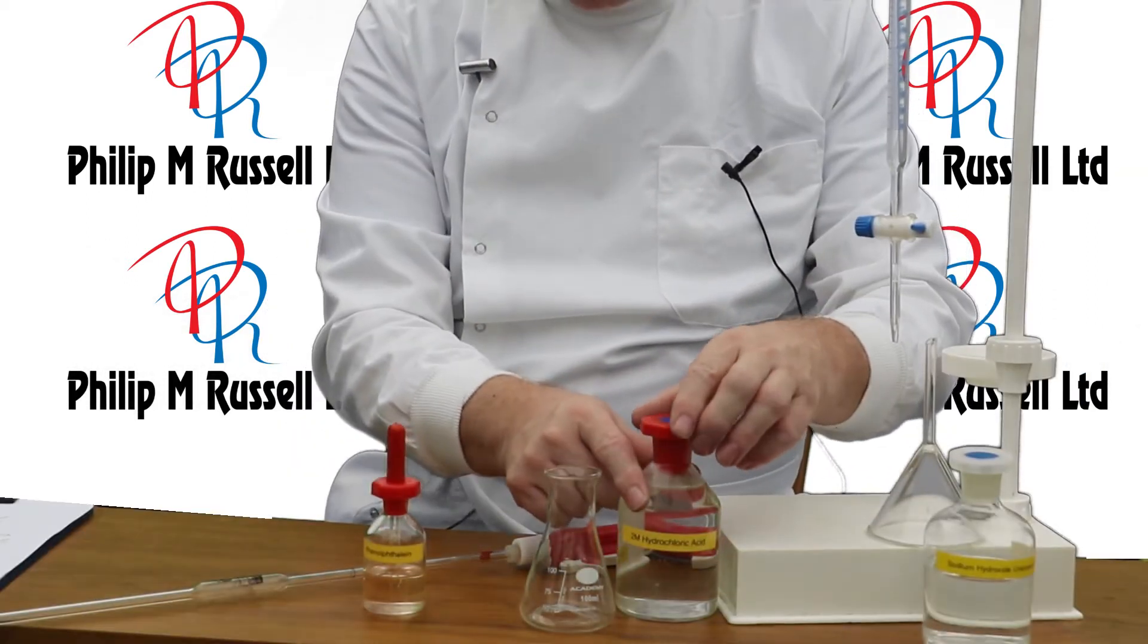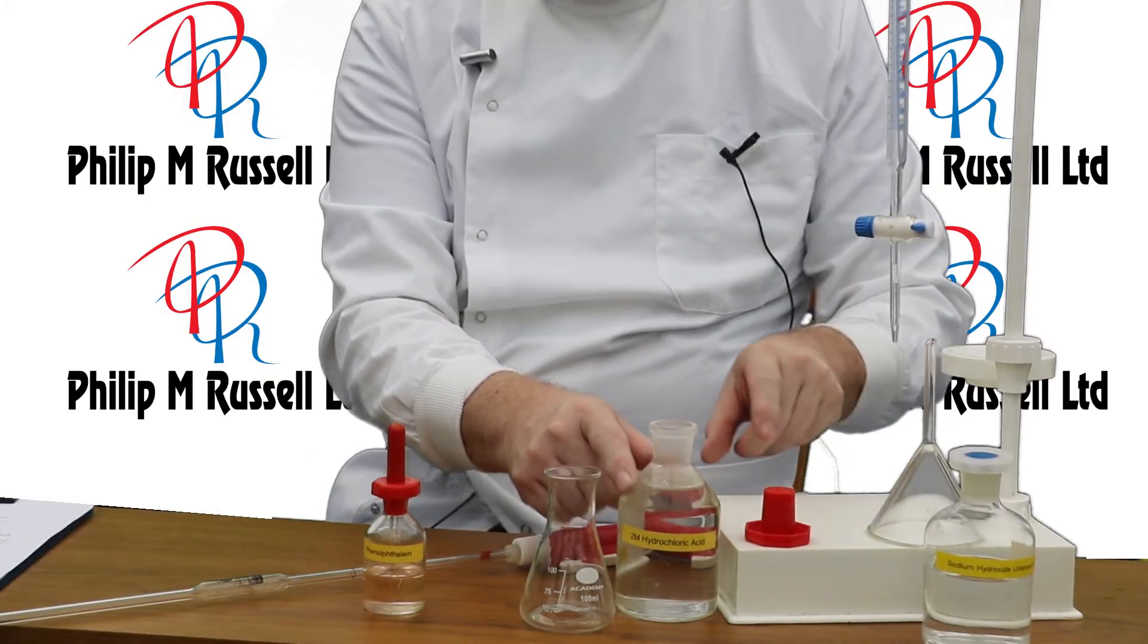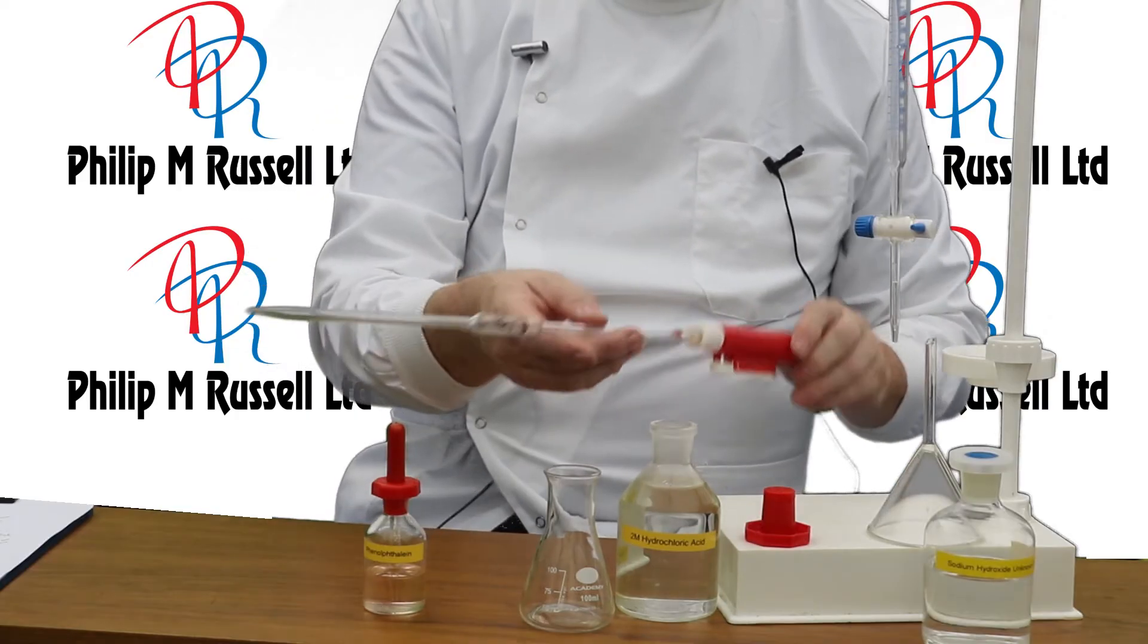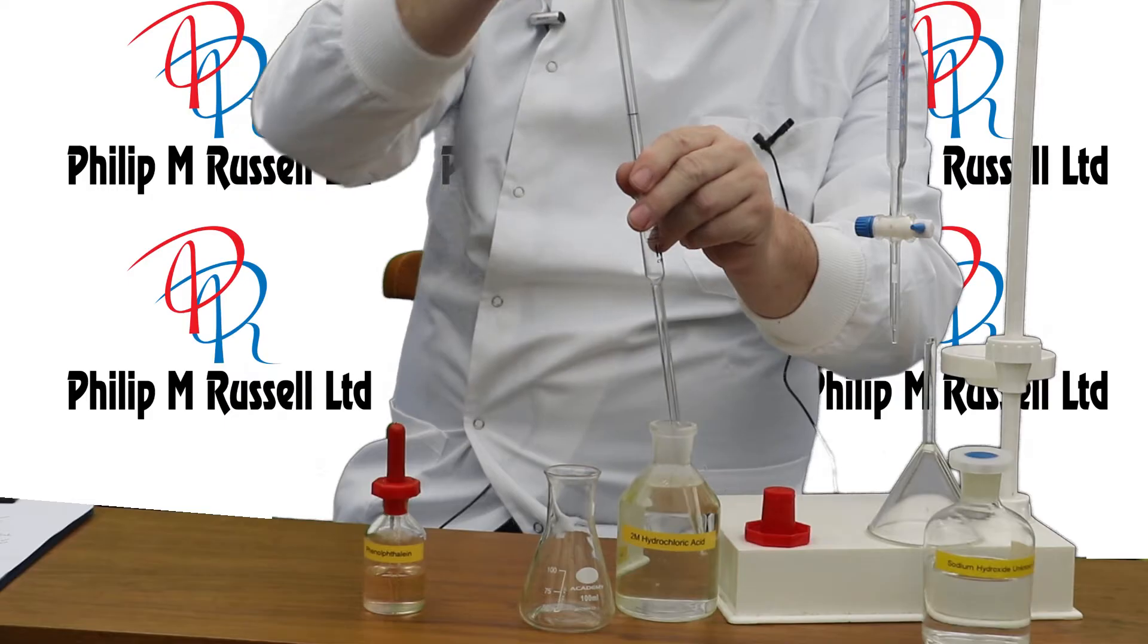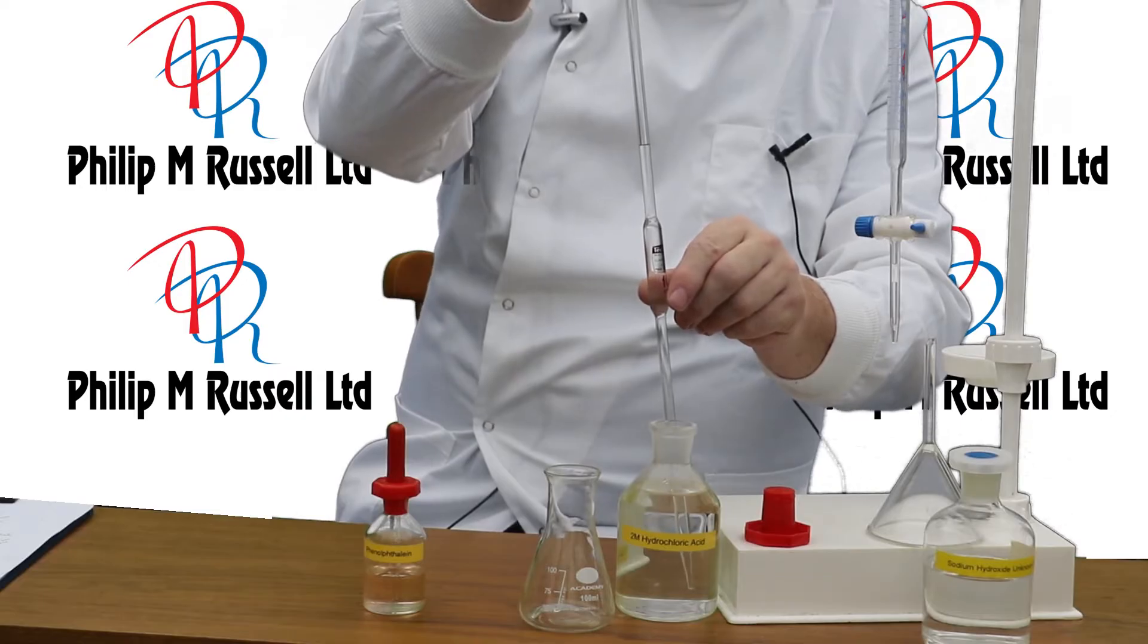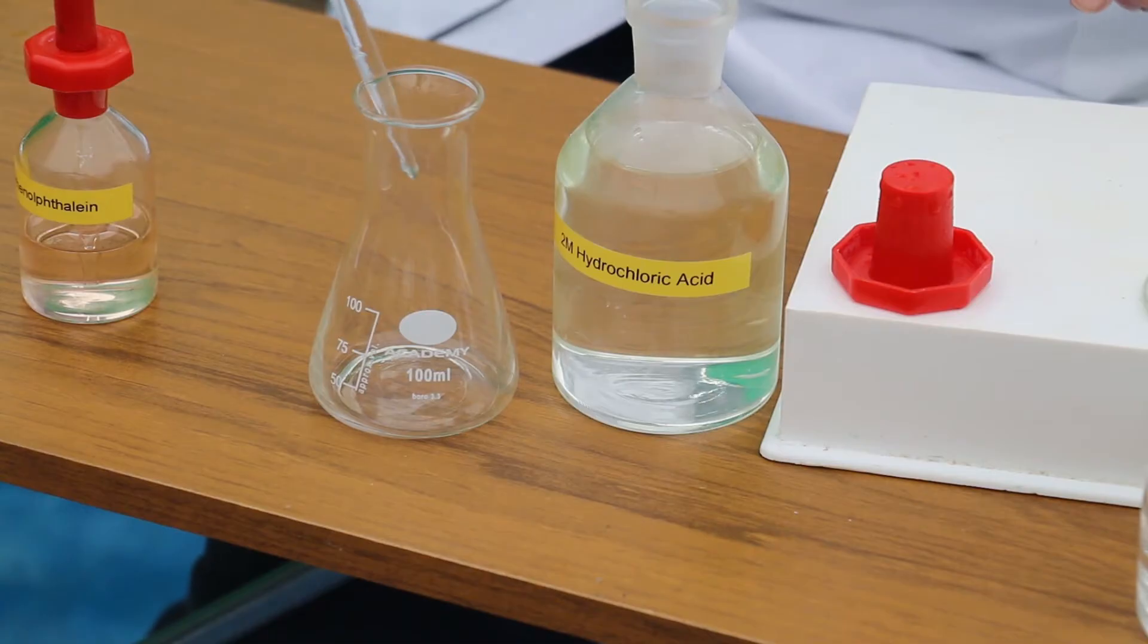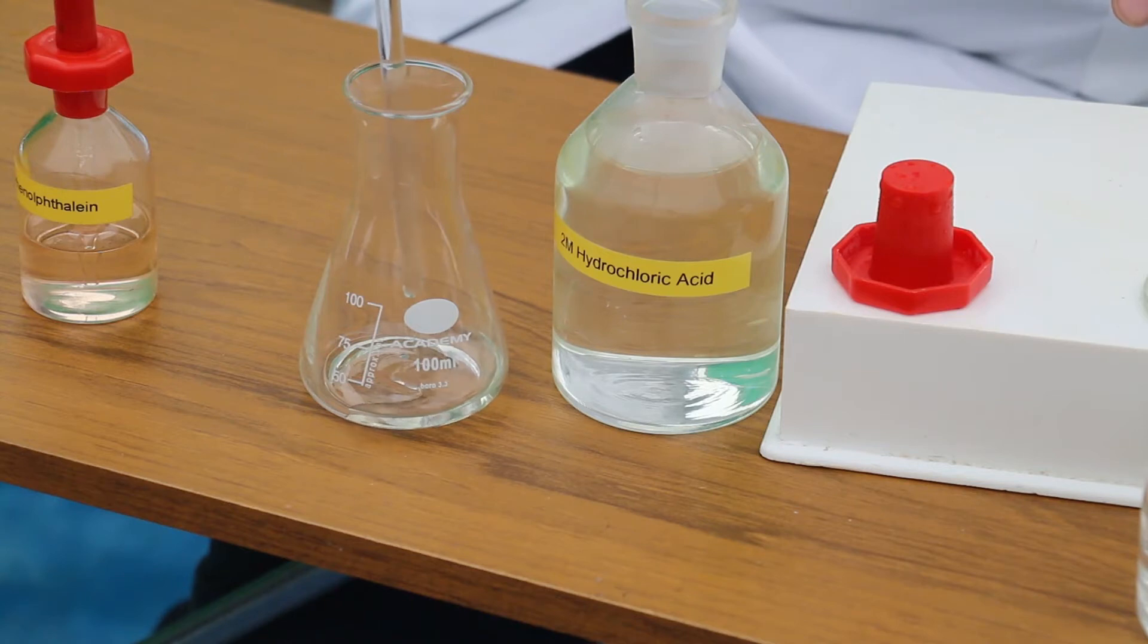Our first operation is to take some hydrochloric acid and put that in this conical flask. To do this we're going to use a pipette. I'm going to suck up exactly 10 centimeter cubed of hydrochloric acid and place it into this conical flask.